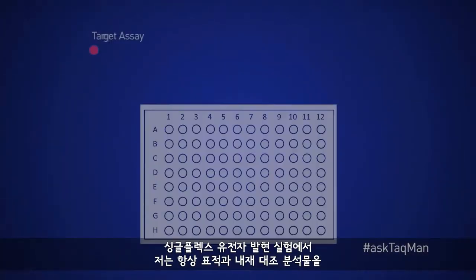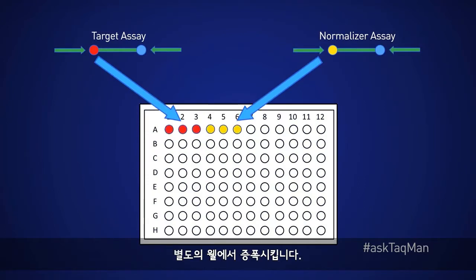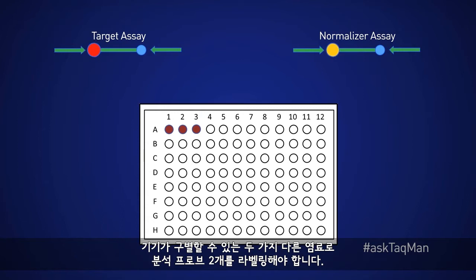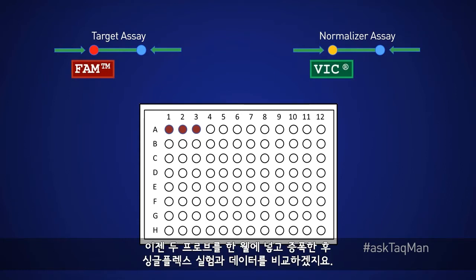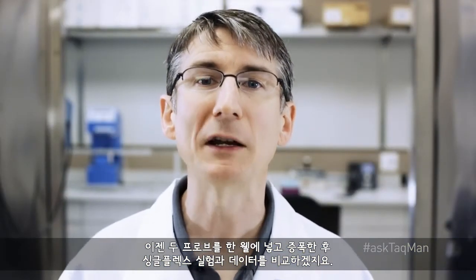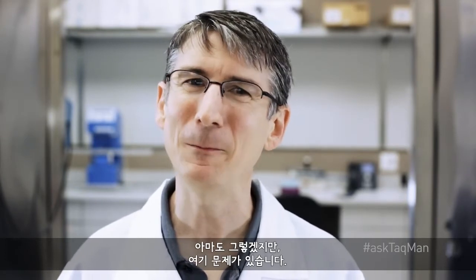Let's review some basics. In a single-plex gene expression experiment, I always amplify my target and endogenous control assays in separate wells. But say I want to pipette these into a single well. To do so, I need to label my two assay probes with two different dyes that my instrument can distinguish — let's go with FAM and VIC. At this point, I simply combine my two probes into a single well, amplify, and get comparable data to my single-plex experiment. Right? Maybe.